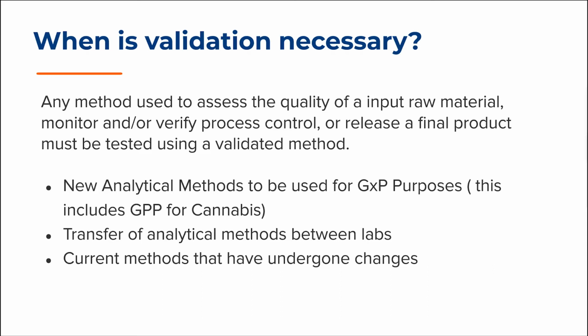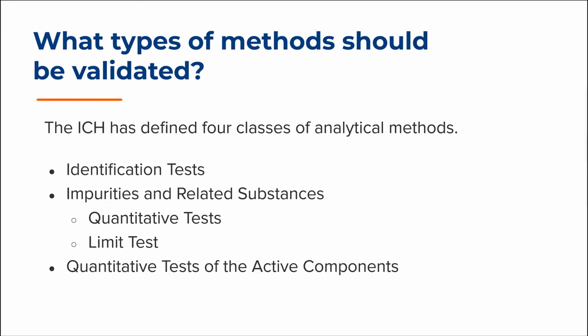Could the potential change in peak shape resulting from the change in flow rate impact the validation, both positively or negatively? If this impact is deemed significant, then revalidation should be conducted. It should be pointed out that these decisions should not be made in a vacuum. In fact, they should be made in collaboration with the quality unit and not solely by the laboratory staff.